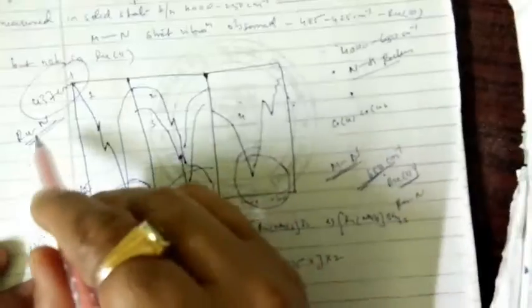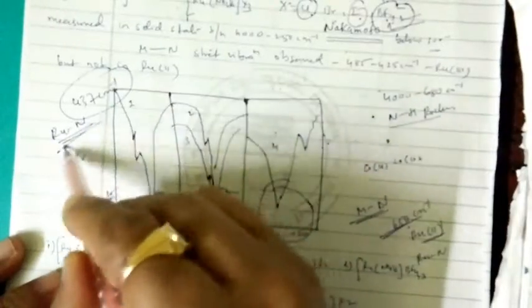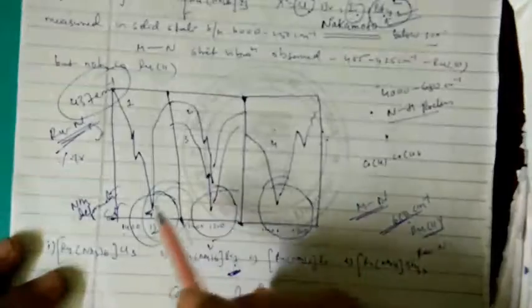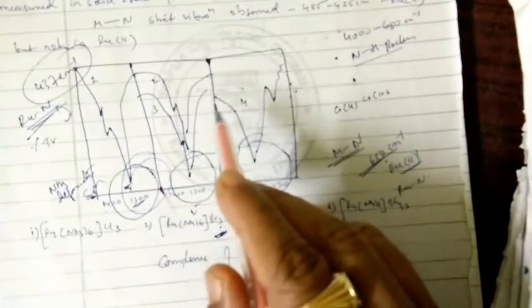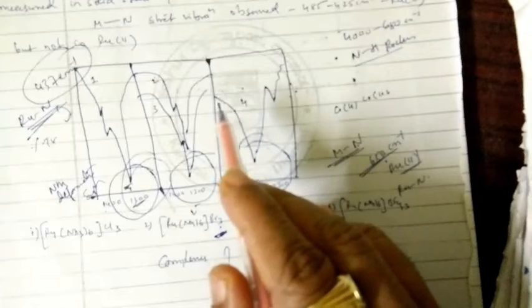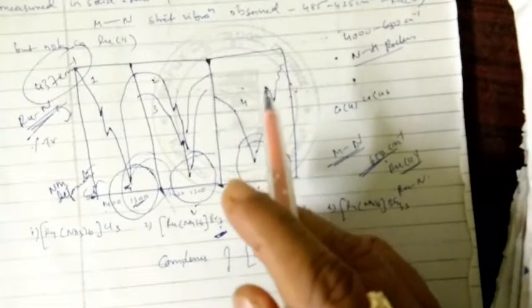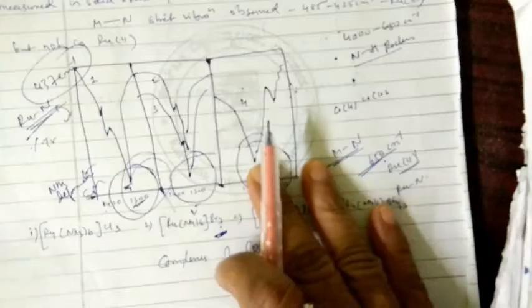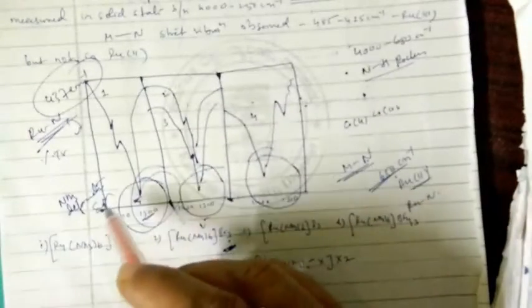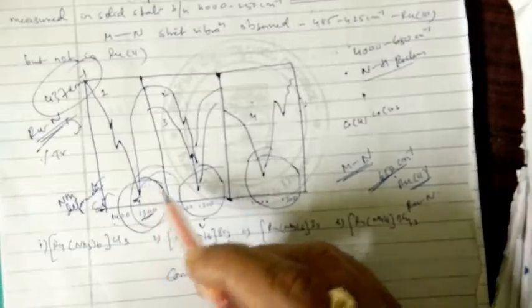In some papers the ruthenium nitrogen stretching frequency is reported at 437 per centimeter. This is the highest, but the symmetric deformation of NH3 has been observed in this case. And you can see the complexes which were reported, done at the scale of 4000 to 650 per centimeter.